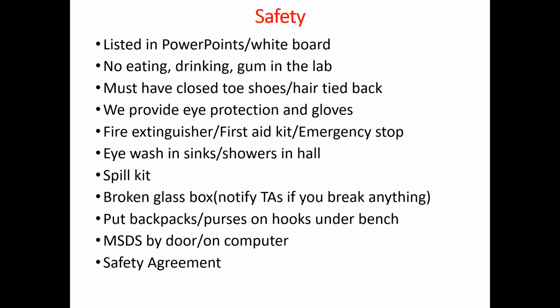There's a fire extinguisher at the front of the lab and a first aid kit. Note that the first aid kit really only has Band-Aids. We're not even allowed to keep aspirin because it expires. By each door into the lab, there's a big red button that is the emergency stop. If you need to turn off the gas and the electricity in an emergency, you push that and it'll turn them both off.